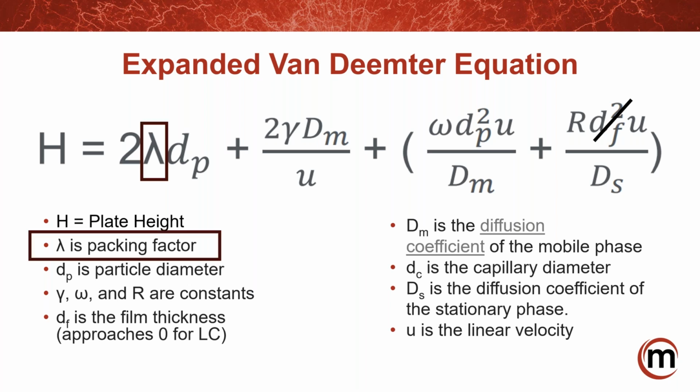So when you actually look at what impact this monodispersity has on each term, in most cases, for Van Deemter, he was looking at small molecules, which is pretty much what people use the Van Deemter equation for. With small molecules, on the C term side, the resistance in and out of the pores is not quite as high because they're moving at such a high velocity. So that kind of minimizes the C term across packing materials for small molecules.